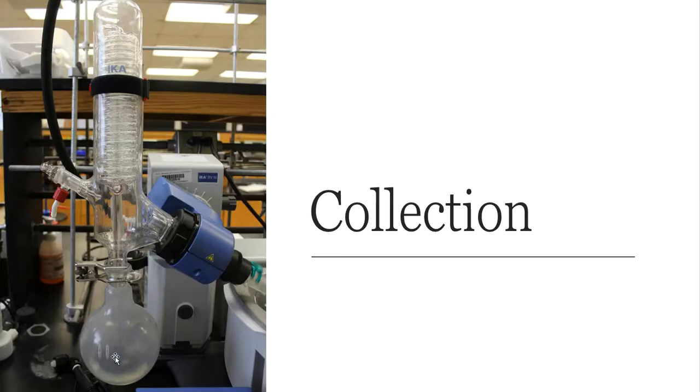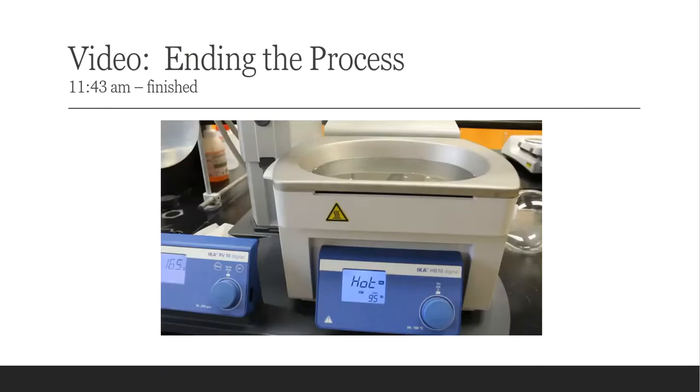So I'm going to continue the collection process. I'm going to get quite a bit of petroleum ether. The majority of that is petroleum ether. And here's a video of me at the end of the process. Up here at the top, you're going to see the time that this process finished.